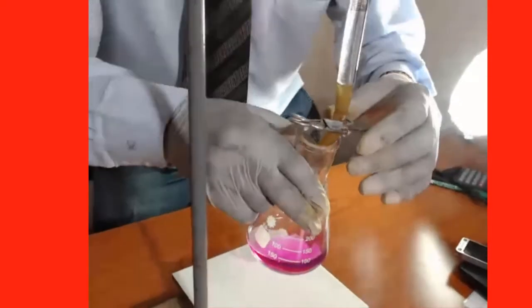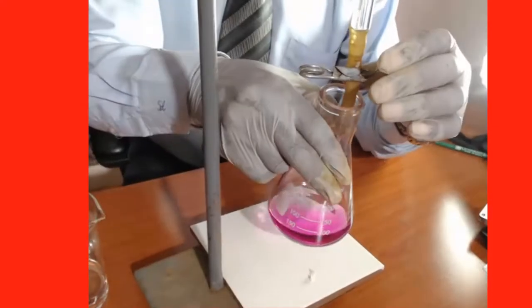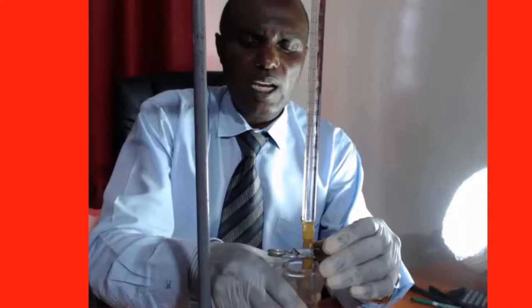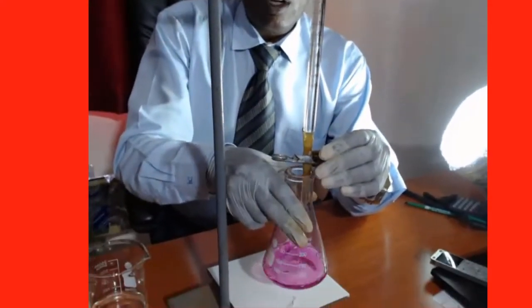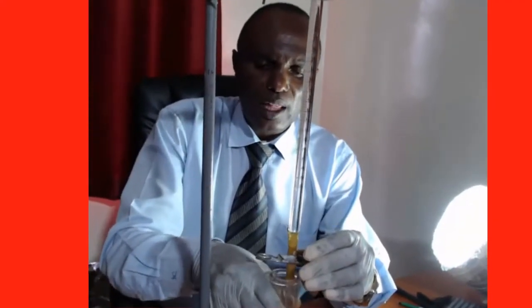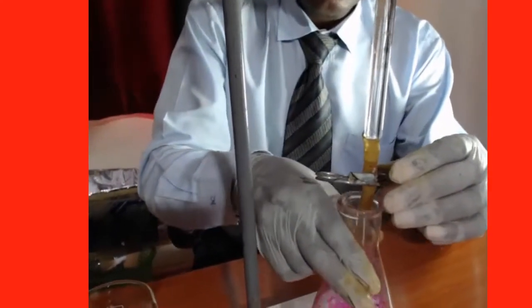So let us now titrate. Open the tap with your left hand, and then you run the oxalic acid into the conical flask. You start titrating. This process is called titration, the process of reacting the two solutions together by pouring one solution into another one.